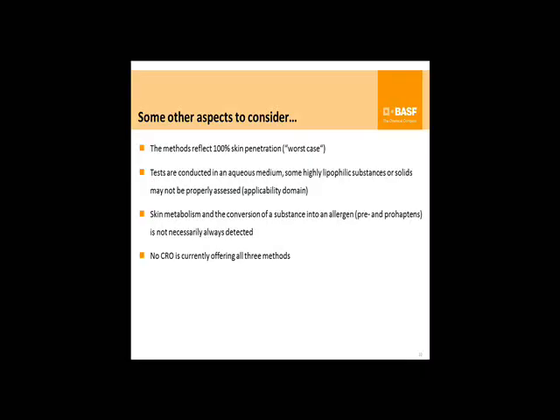And also in additional work that's currently ongoing within our laboratories, we look at compound classes for water solubility and other issues determining the applicability domain. Also, skin metabolism is not very well covered by the assays, so there's a lot of pre- and pro-haptens that are not correctly predicted by the individual methods, and hence the strategy. And one thing that's more of practicability, there's not too many CROs that are currently offering all of these methods.